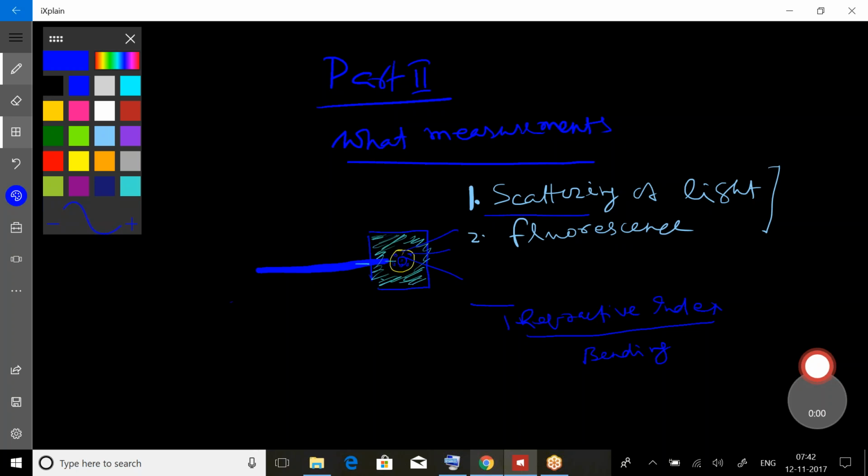That means when the complexity is high, the light interacting with the different matter further deviates the light. So this is scattering happening, the bending of light, the scattering of light. Photons interact with the molecules and then change the path. That is scattering. So let's talk about scattering. What are the different types of scattering?